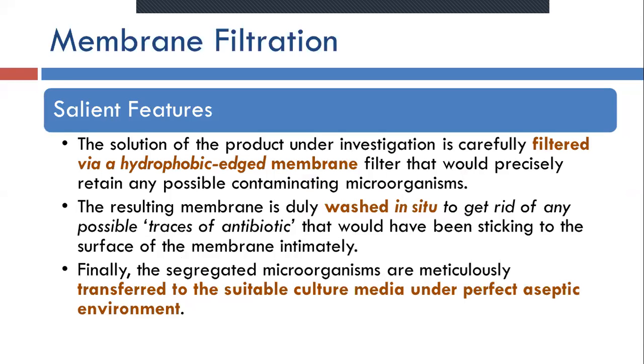So how is it performed? As I already told you, the solution of the product under investigation is carefully filtered via a hydrophobic edged membrane. That means the edge of the filter paper will have a hydrophobic material so that there will not be any sticking of material in the edges.